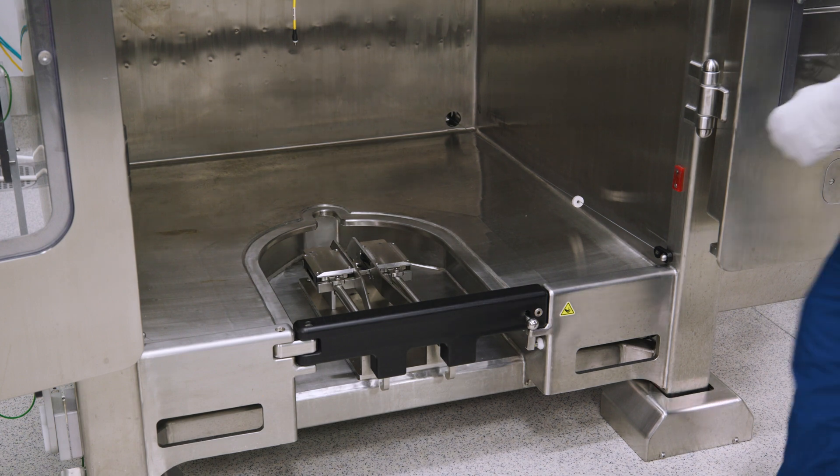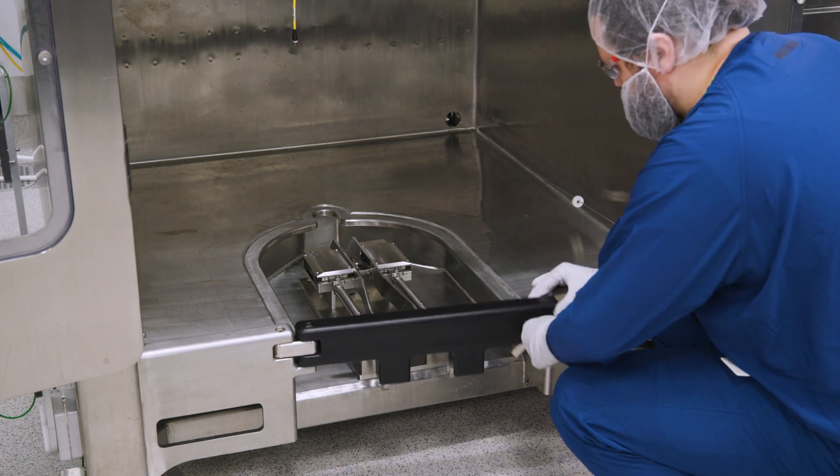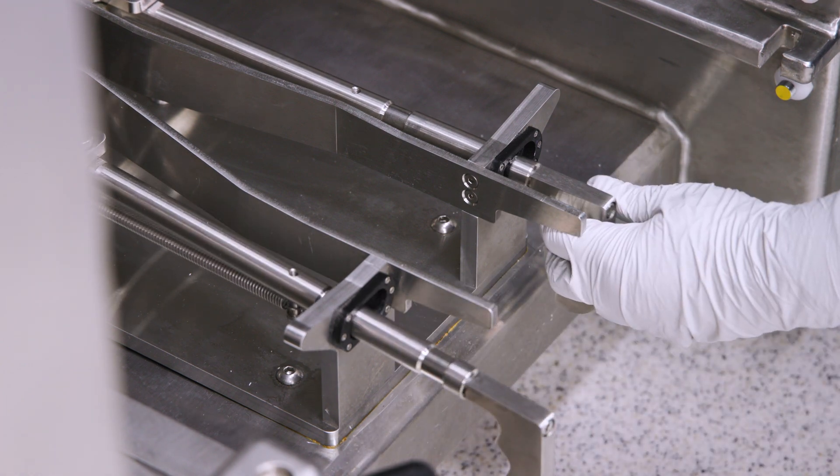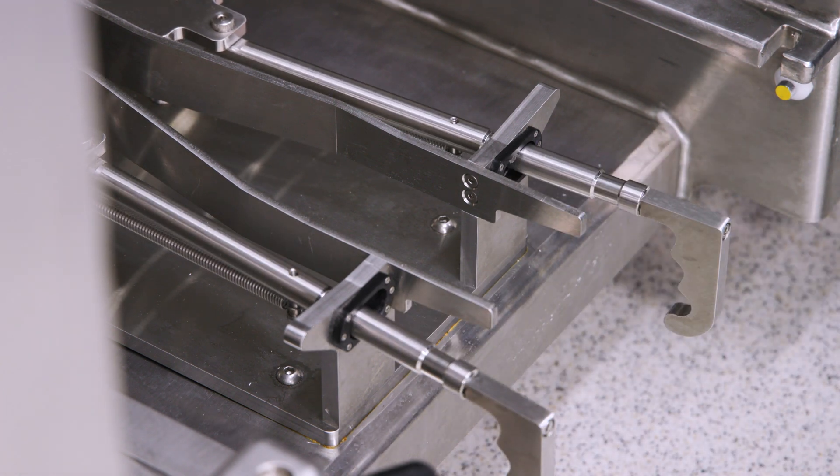Take hold of the latch on the right side of the bottom front access gate. Lift the gate up and swing it open. Pull out the two handles behind the access gate and push each handle out in the appropriate directions.